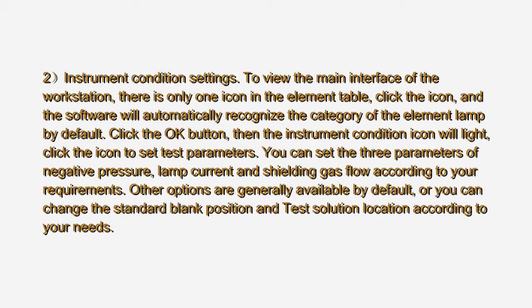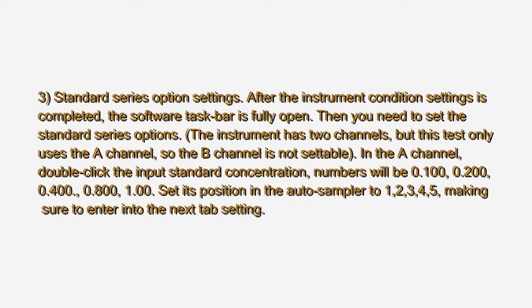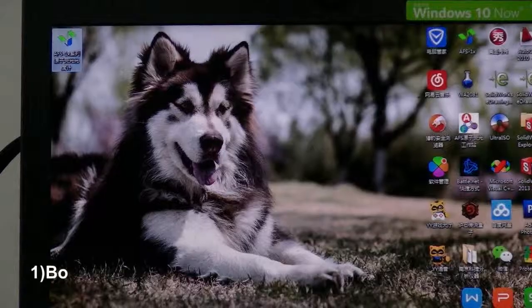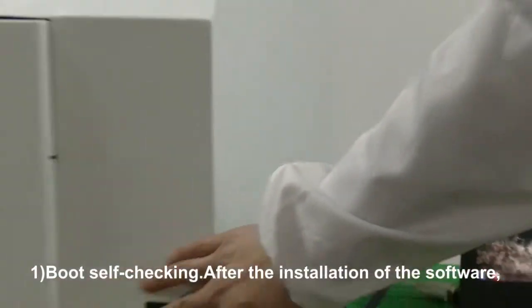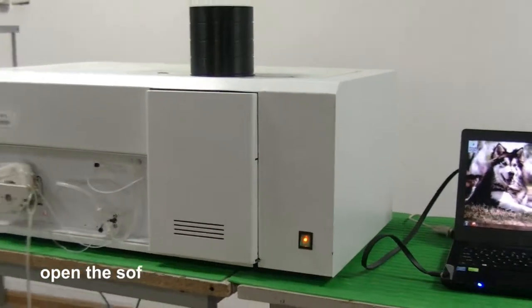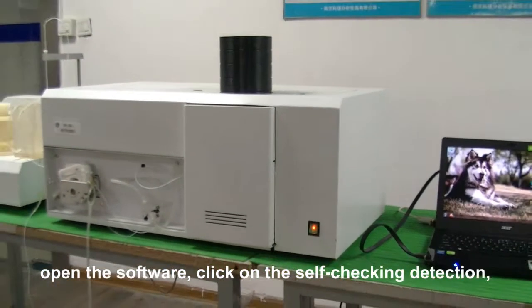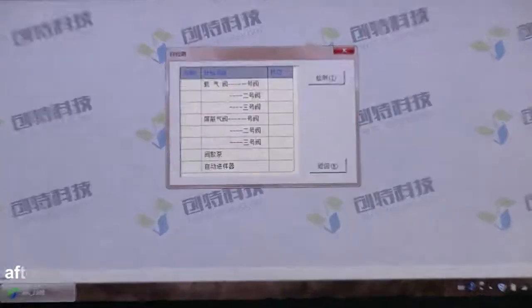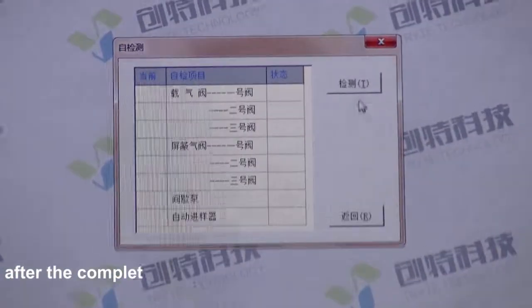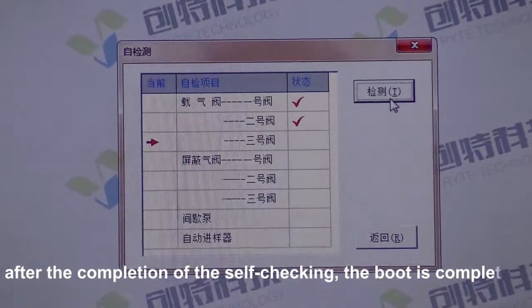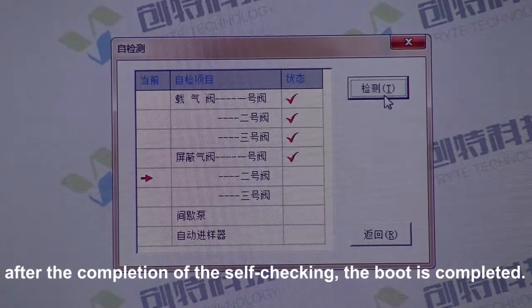Step 3: Software Settings. Sub-step 1 — Boot self-checking. After installation of the software, you can directly turn on the instrument power switch. Open the software and click on the self-checking detection. After the completion of the self-checking, the boot is completed.